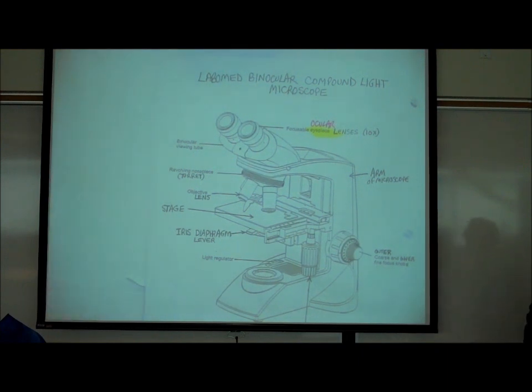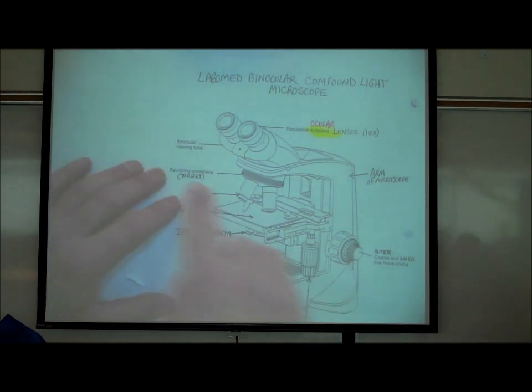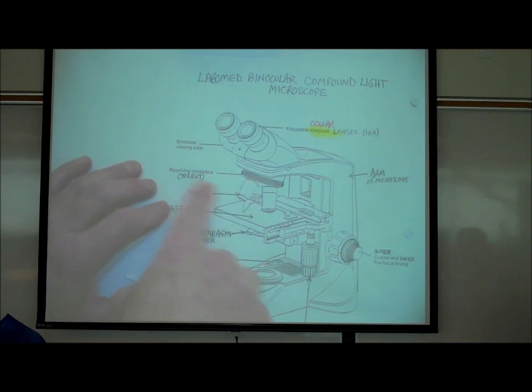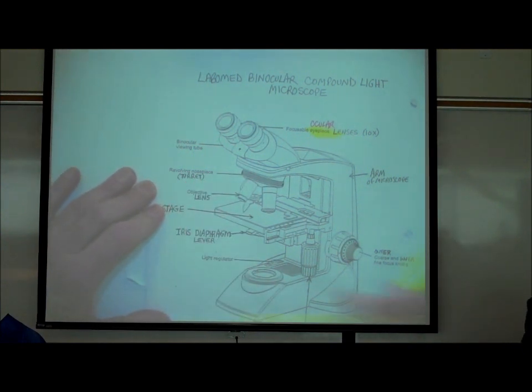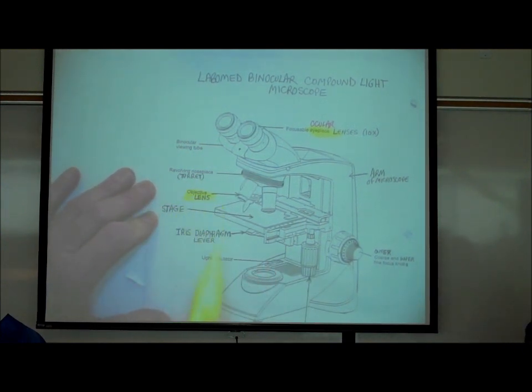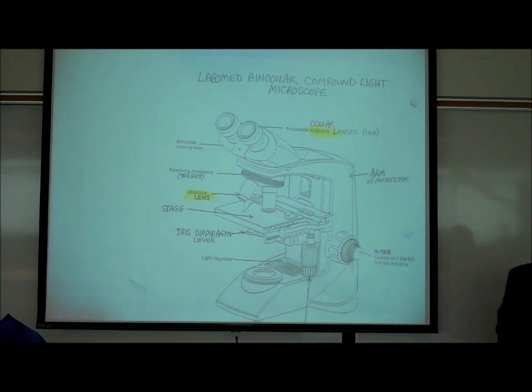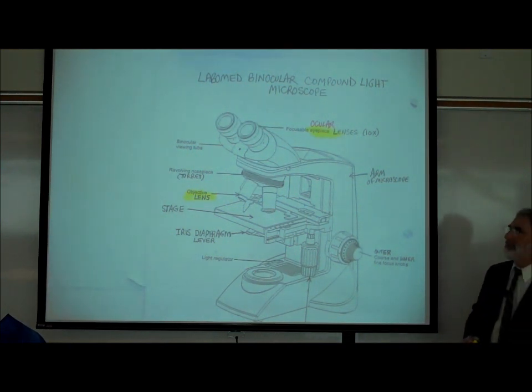Attached to the turret or revolving nosepiece are the objective lenses. There are four objective lenses on this microscope.